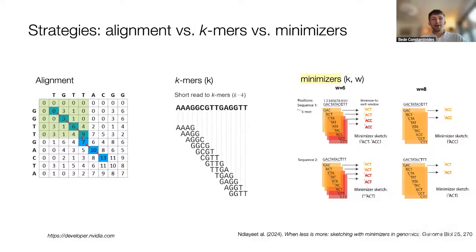So the problem with k-mers is that the information they store is quite redundant. But there are elegant ways of selecting k-mer subsets that perform much better than naive random sampling, and these are often called winnowing schemes. Minimizer schemes, which are on the right here, are an example, and they have this lovely property that given two identical sequences, you always get the same minimizers for both, and minimizers are k-mers. So you always select the same k-mers from two identical sequences. And if the sequences are similar but not the same, you select most of the same k-mers.